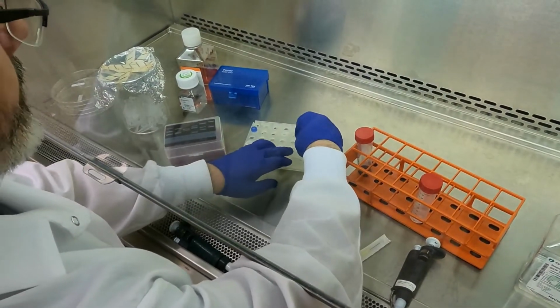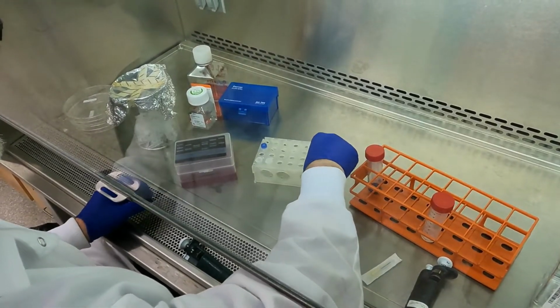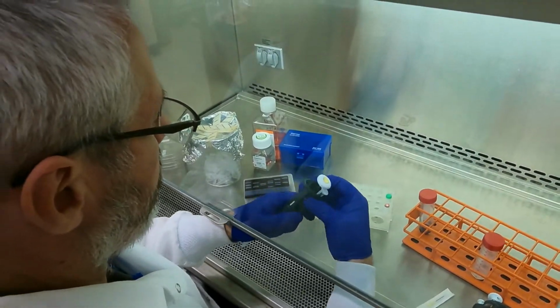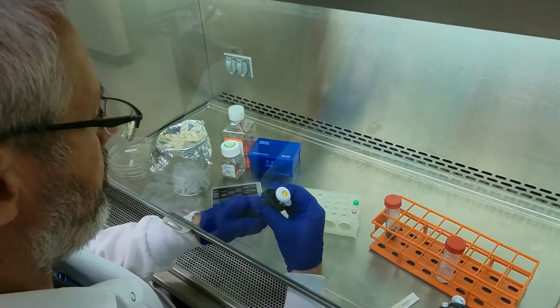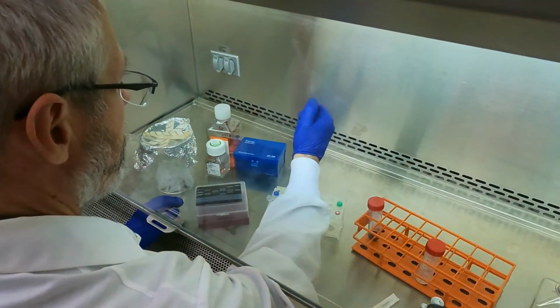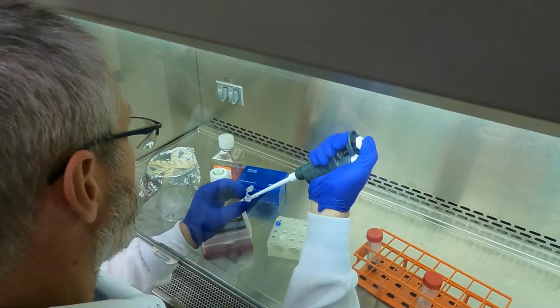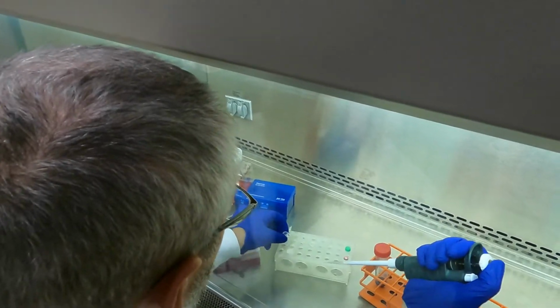Now, you've got to kind of speed things up a little bit now, because they don't like being in the intracellular buffer here. So we'll go with the C16 first. And we're going to add 40 microliters. Like that. Mix it a couple of times. Right. That's the first one.